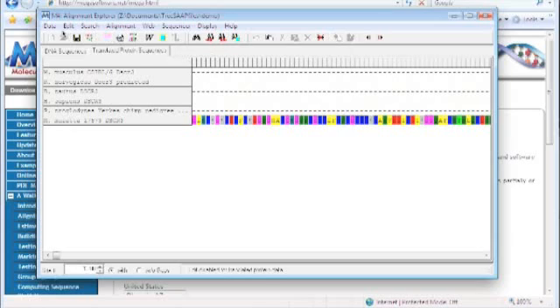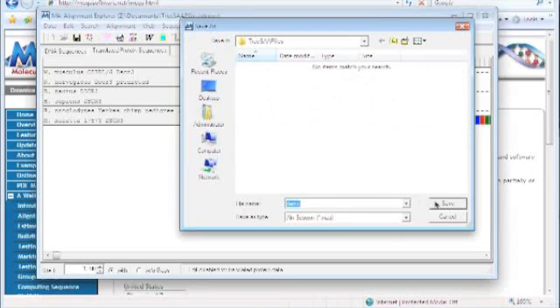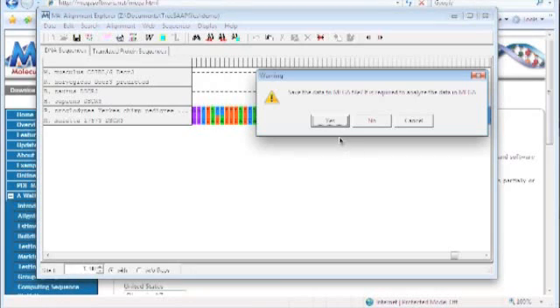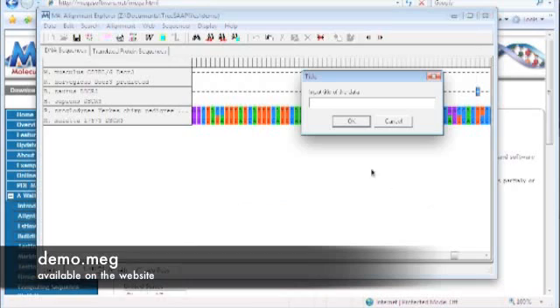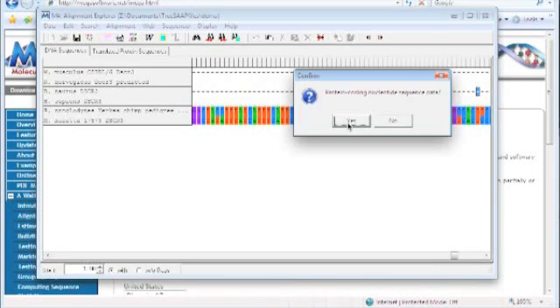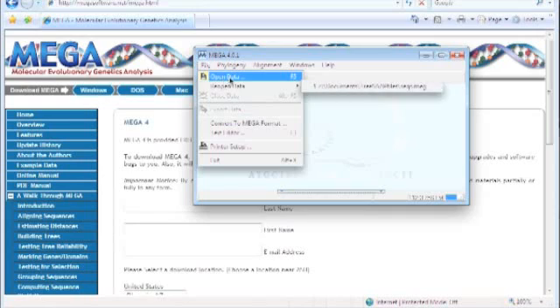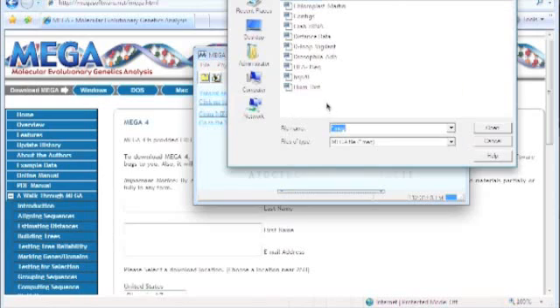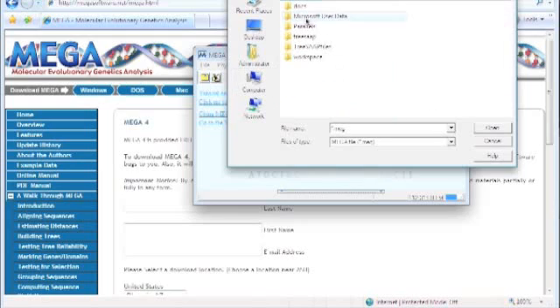Now that we've done that, you can save it as a MEGA format — it'll ask you to save as a MEGA format right here, so I'll just save it right now. I'll name it 'demo,' and it'll ask for a title. It's protein-coding nucleotide sequence data. Then we can open that up — usually it asks if you want to open it, so we're going to browse to where we saved this and open it right up.